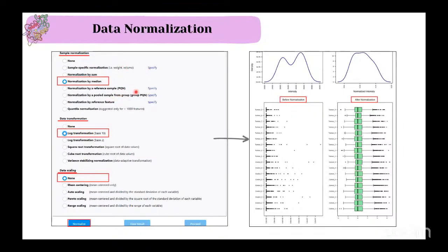In our proteomics cases, median normalization mostly satisfies the criteria. Before normalization, you can find two humps, and after normalization you can find a single hump which has the perfect central tendency aligned to it.